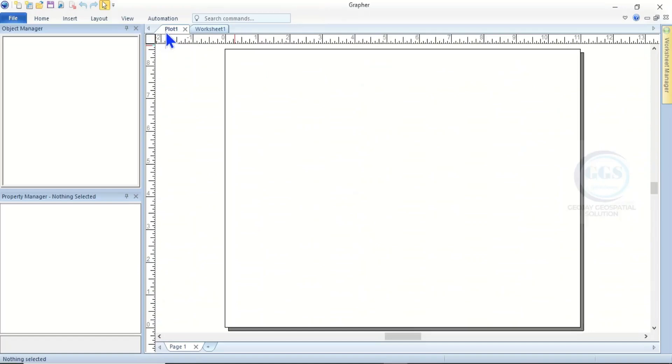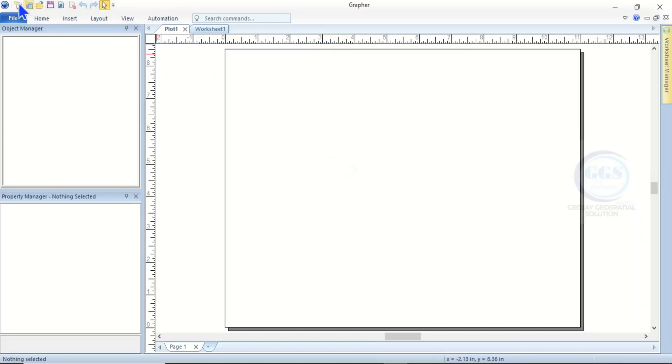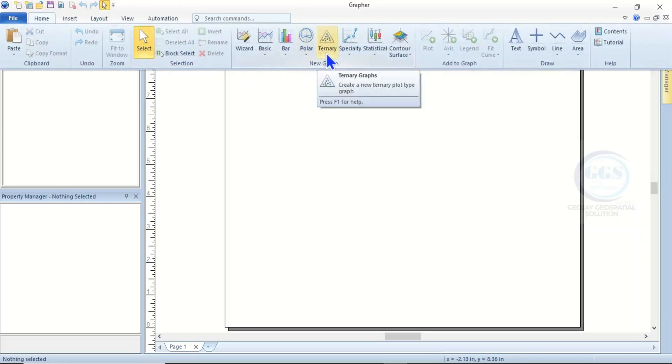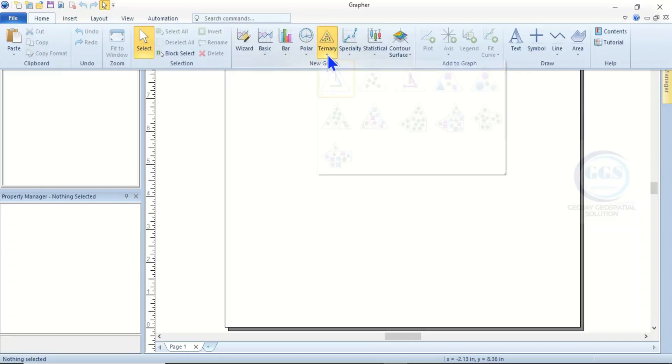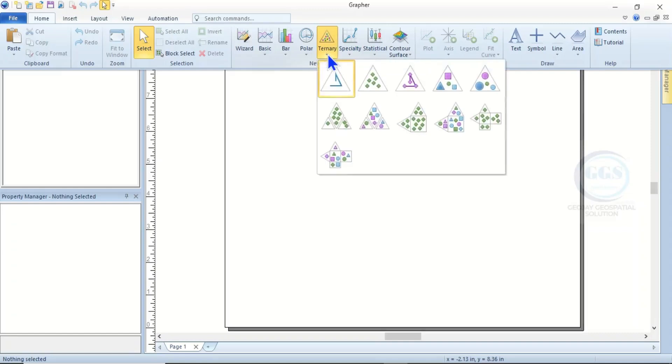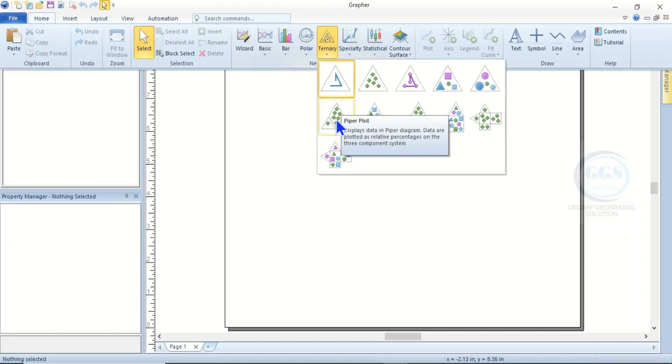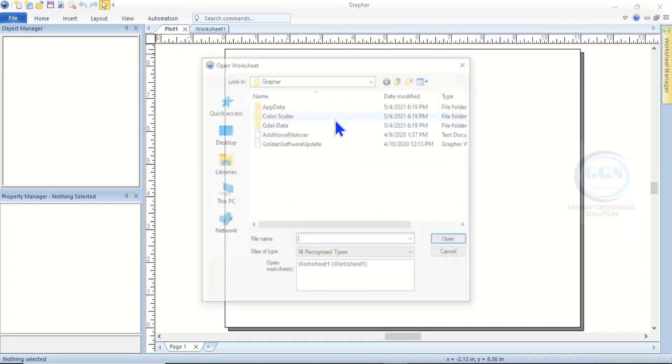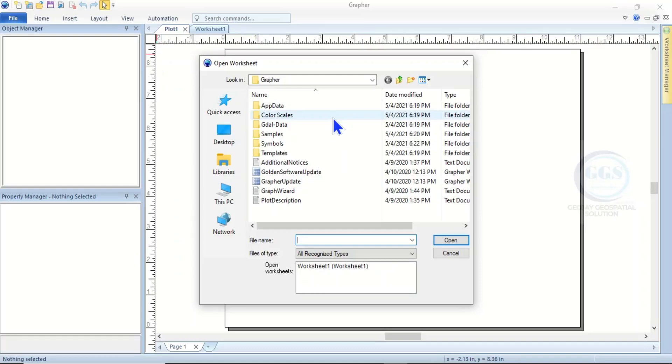Now to plot the Piper trilinear diagram, as you have launched Grapher, come to Home - make sure you are under Home - then come to Ternary. Click on the drop-down and you see the Piper plots. This is the Piper plots - click on it.